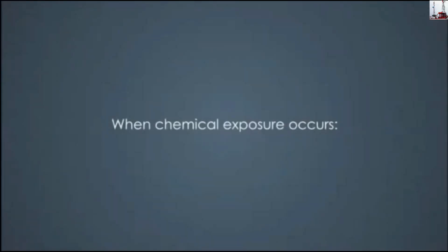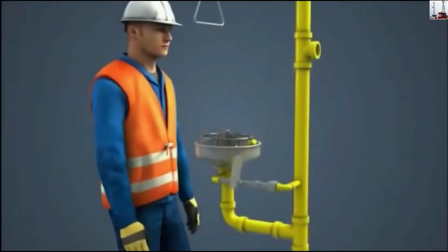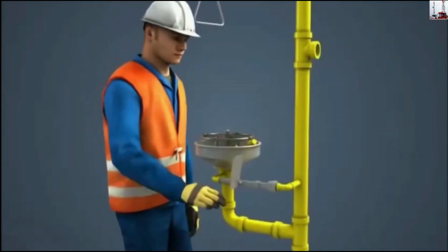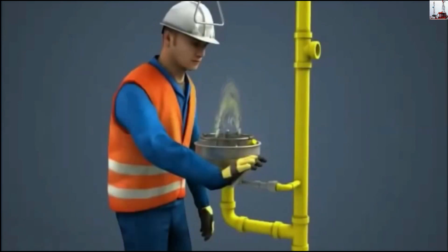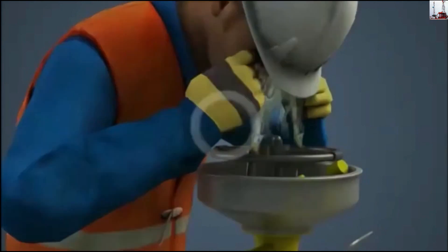When chemical exposure occurs: one, immediately move to an eyewash station to use either the paddles, levers, or pole lever to turn on the eyewash. Three, hold your eyes open with your hands to ensure water reaches the eyes.